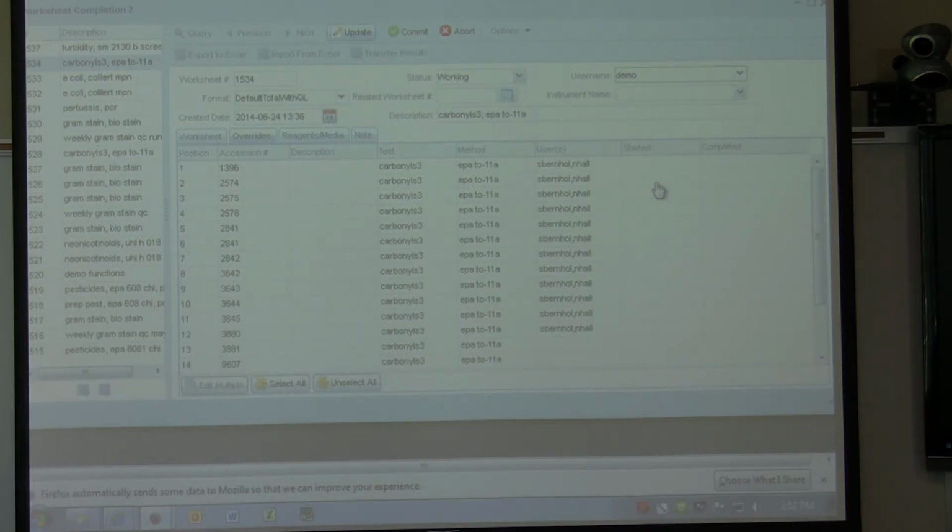No, it's actually the opposite. The start date for the QC is after I had already run it, so they just prepped it. I think it's bringing their prep date, because it's got their prep initials, like say PMA for Peter Ma, and then the date he did the extraction is supposed to be carried over.